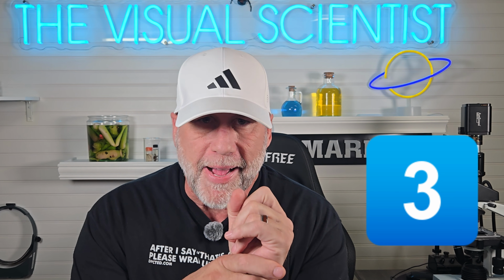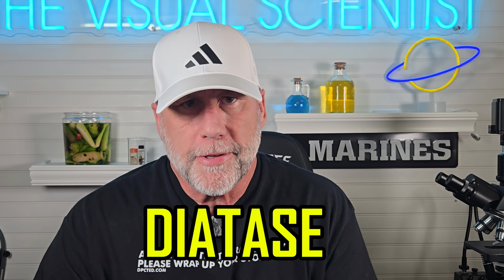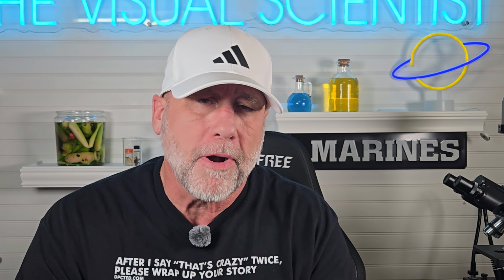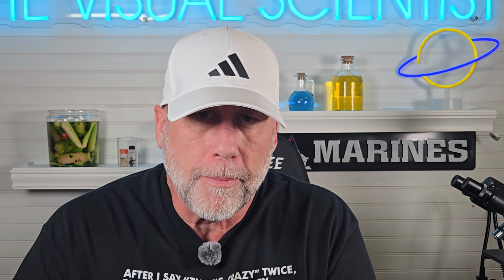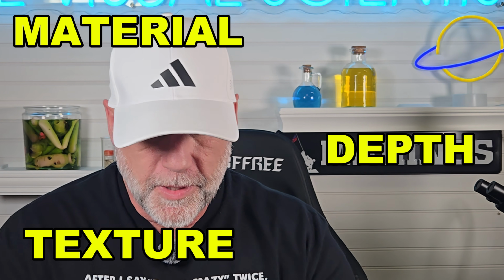Number 3, biological complexity. Real, minimally processed honey contains enzymes, specifically diastase, which bees add during nectar processing. You can't see the enzyme under the microscope directly, but you can see what it leaves behind: texture, depth, material, and a mess. Now, what removes all 3 of these things?